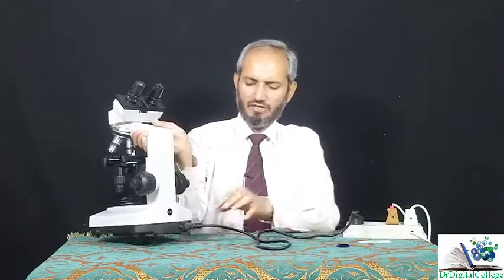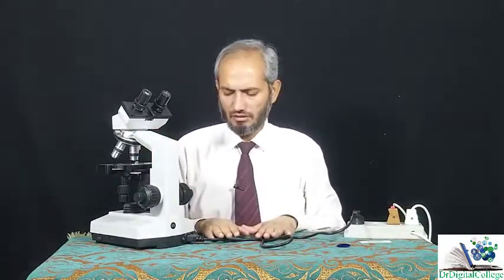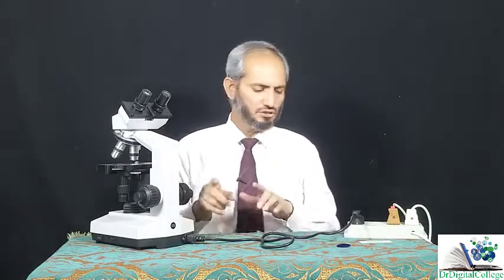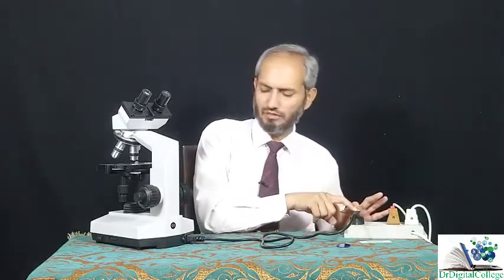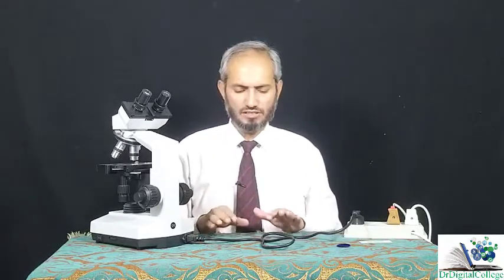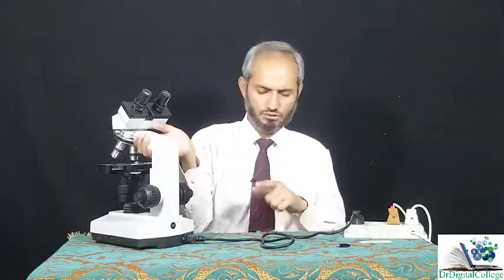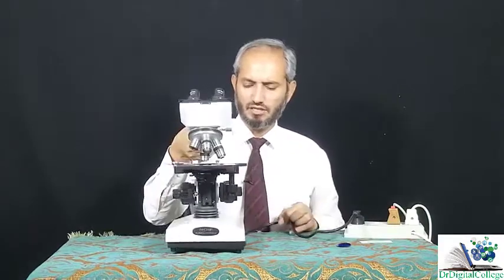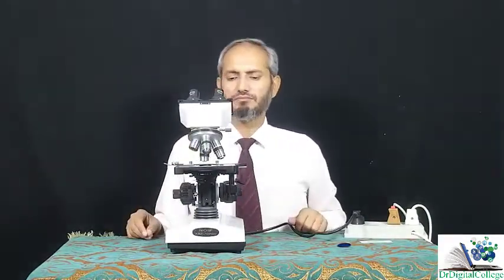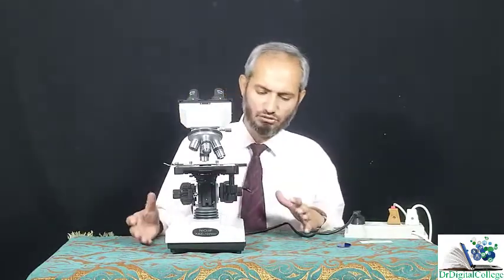This is the power cable and it should be fixed. This is the job of your lab technician, that he or she will give you an adjusted power cable, and you should take care of it because this is high voltage electricity, the same electricity which is being used in your laboratory or household things. So you should be careful about it. I hope that there is nothing more.